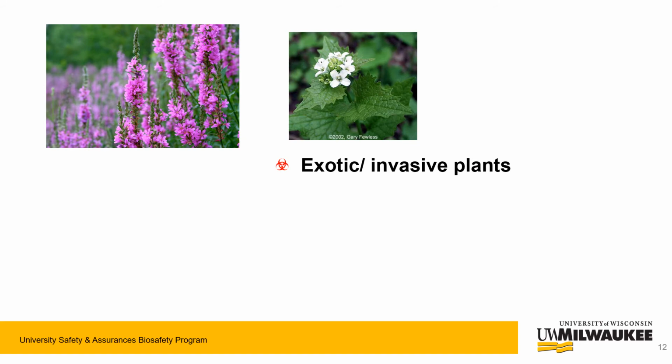We also handle exotic or invasive plants as biohazards, as we seek to ensure that they are completely destroyed prior to disposal and that we contain their pollen and seed, as they are risks to the environment. Shown in the photos are purple loosestrife and garlic mustard.